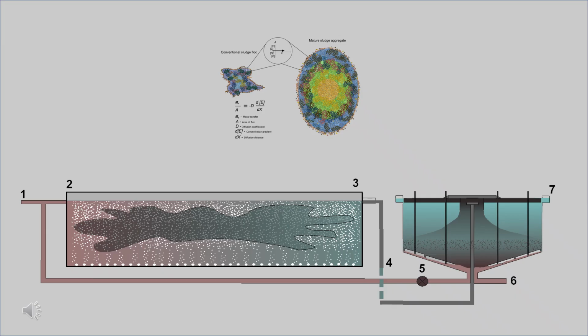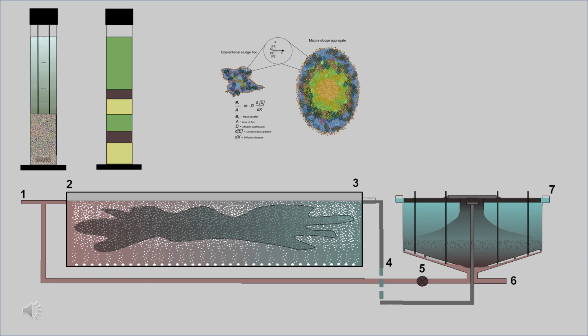When we take a wastewater sample at the start of the process, point 1 on the diagram, the sample contains all four of the organic fractions of pollutants as described previously. During the aeration phase, all the pollutants come in contact with the biomass culture and are transferred to the biomass.